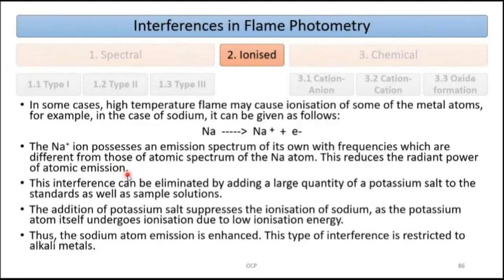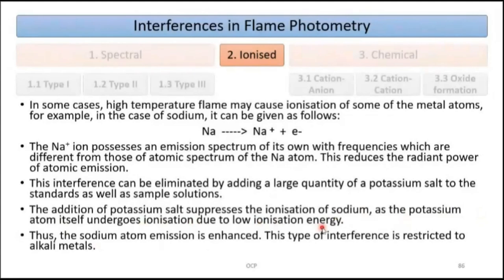This interference can be eliminated by adding a large quantity of potassium salt to both the standard and sample solution. Potassium has lower ionization energy, so it ionizes preferentially instead of sodium, suppressing sodium's ionization. The addition of potassium salt suppresses sodium ionization; sodium atom emission is enhanced. This type of interference is restricted to alkali metals only.